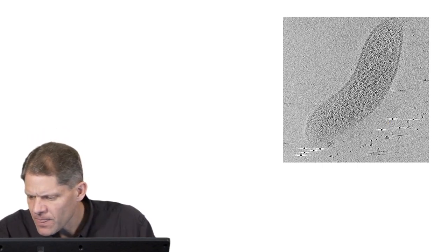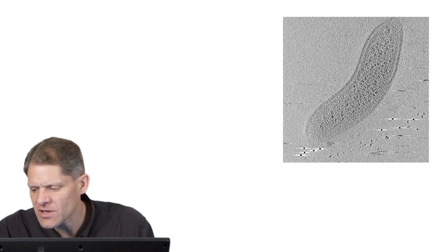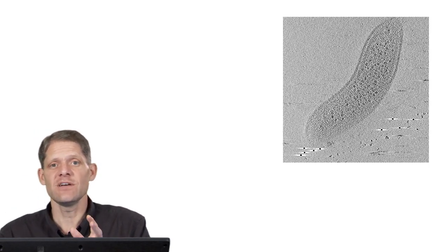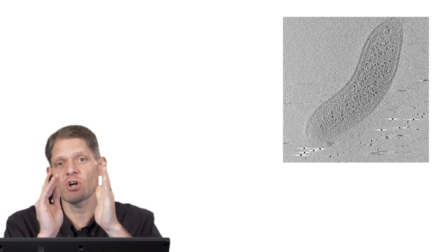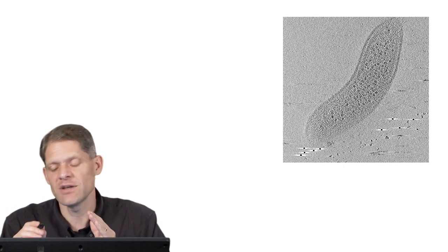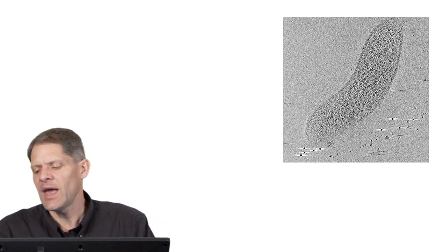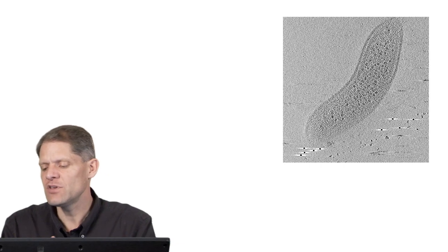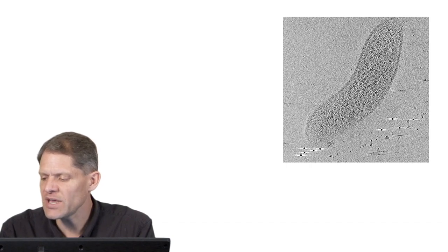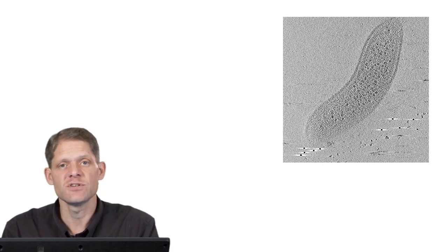And when you look carefully at this gold bead, you see a dark spot in the middle, but it's surrounded by a white halo and actually white streaks on either side. This illustrates the point spread function. In fact, it was a single spherical gold ball with sharp edges. But here in the image, it appears as a dark spot that's a little wider than it should be, with a white halo surrounding it and white streaks beyond that. And this is the point spread function of this particular cryotomogram. And as you can see, each of the gold beads, which were each spheres, is surrounded by the same kinds of halos and streaks around it.